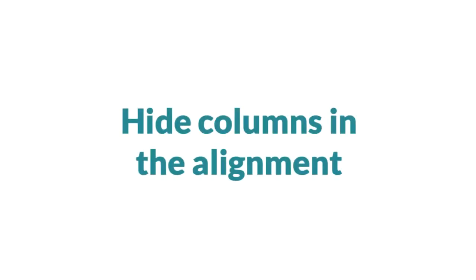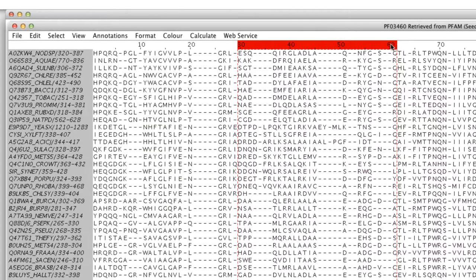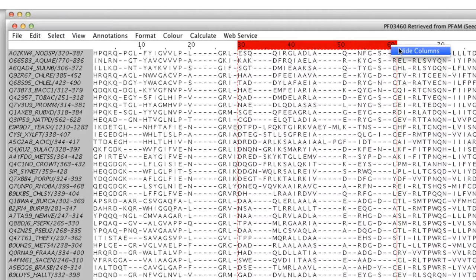Selected columns can be hidden in a similar manner by clicking on the alignment ruler and selecting the hide column option in the context menu.